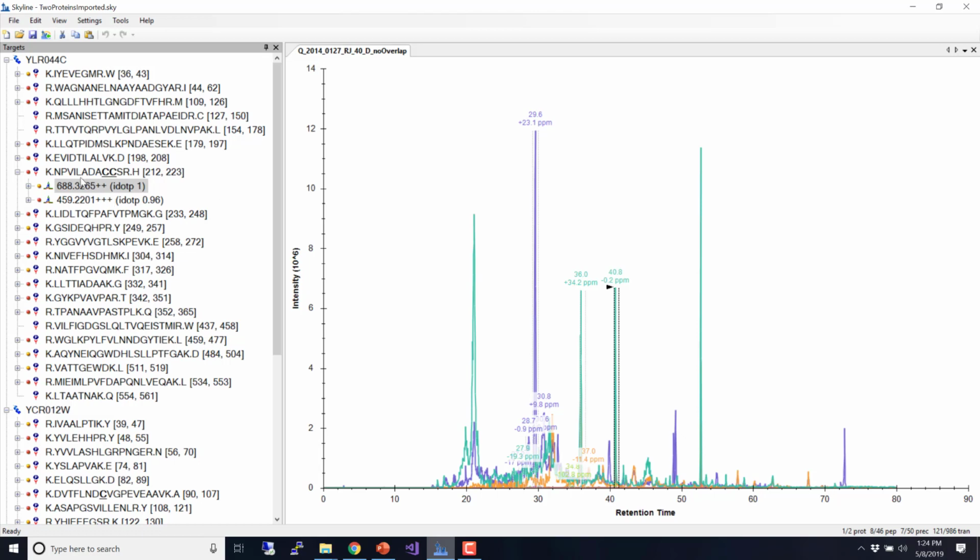So this is a particular peptide that Jarrett was interested in looking at. If you look at this sort of naively, this is again a huge amount of signal to be able to interpret.